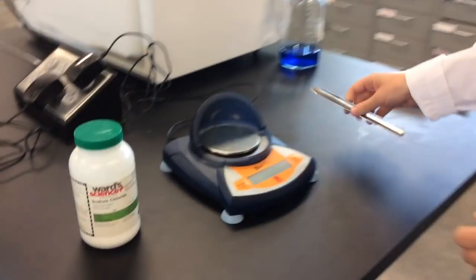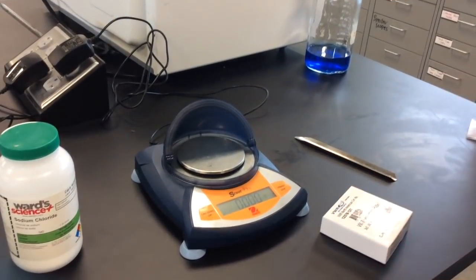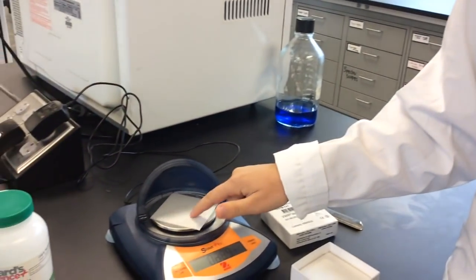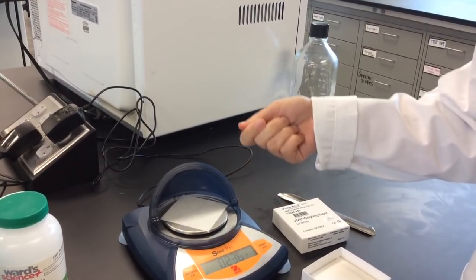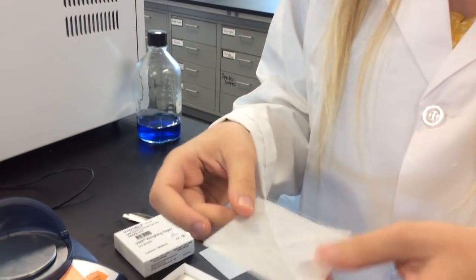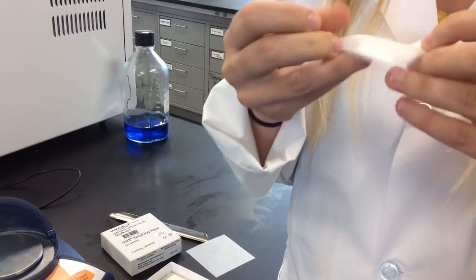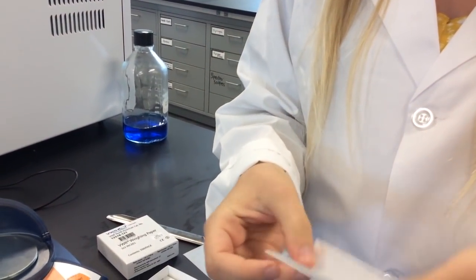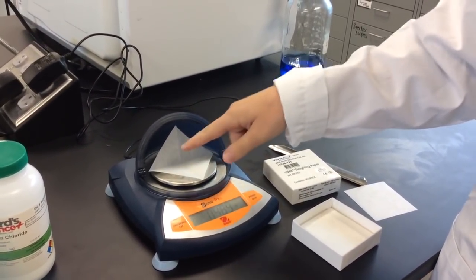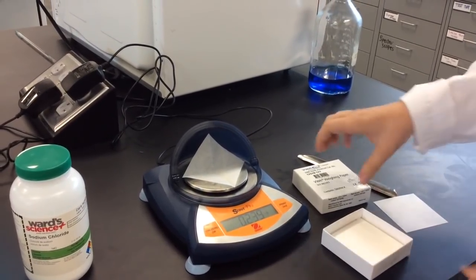Now moving on to this tabletop balance — same sort of deal. For this example, I will be using weigh papers. They are flat. When you are transferring solids with a weigh paper, it's really hard to pick up and move. So what I recommend is folding your weigh paper to make a little boat — fold one way and fold another way to make a small triangle. When you open it, it creates a channel for the solid so it's not slipping all over the place, and you can carry it more easily instead of it flying off the sides of a flat piece of weigh paper.